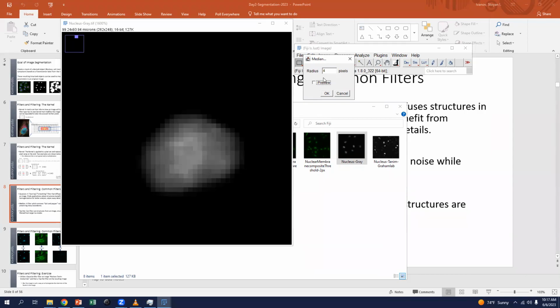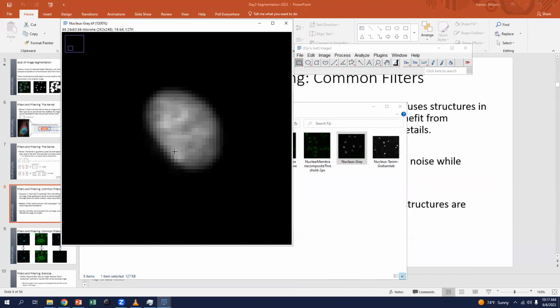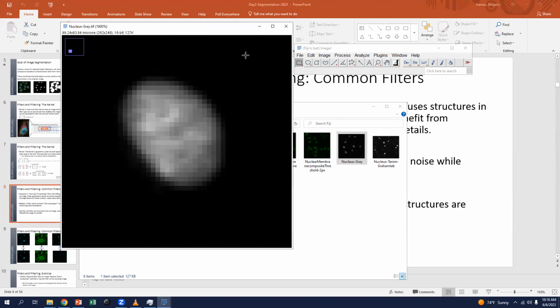information here. We can see how even as we increase the radius, the boundary of the cell remains more or less the same. At 6 sigma with a Gaussian filter, we would have already washed out the signal, but it remains here. It is useful in instances where you may not have a homogeneous membrane. I see this sometimes in really high resolution images. The membrane would not have stained equally all around, so you have little gaps in it.